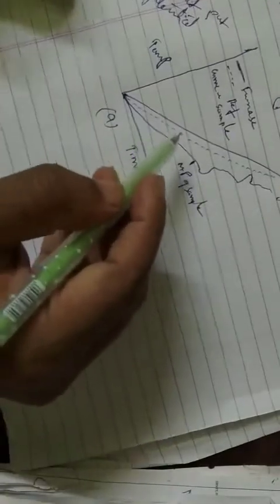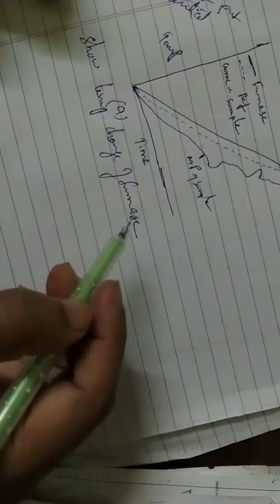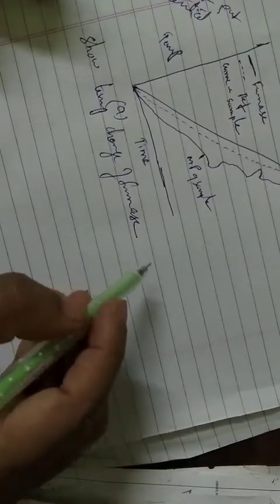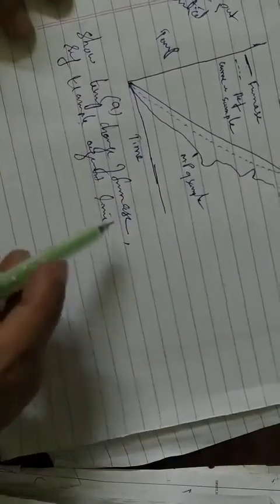This graph shows the temperature change of the furnace, the reference and the sample against time.